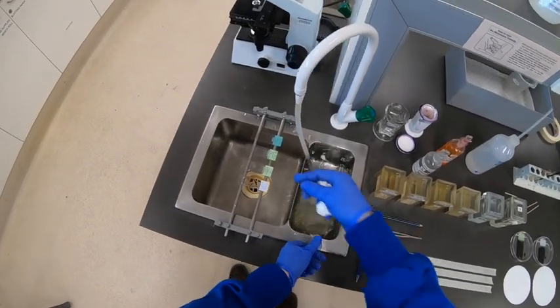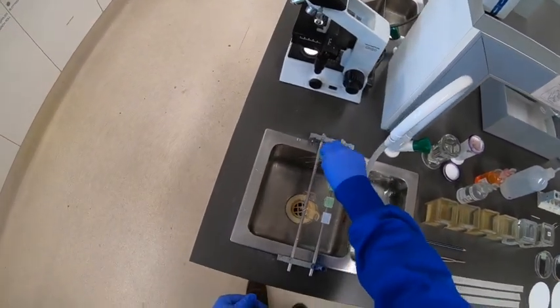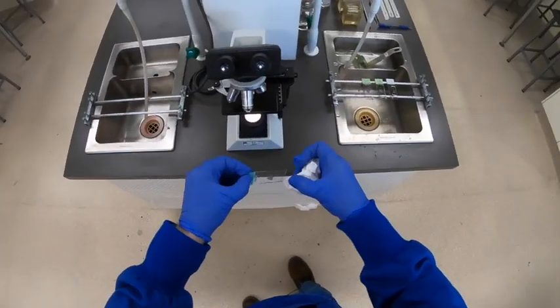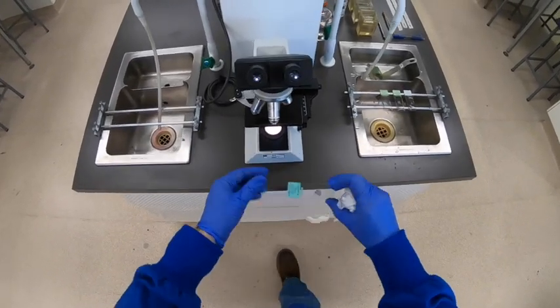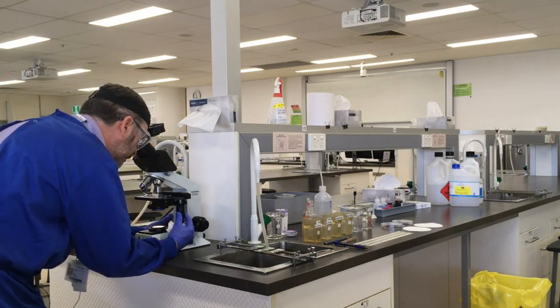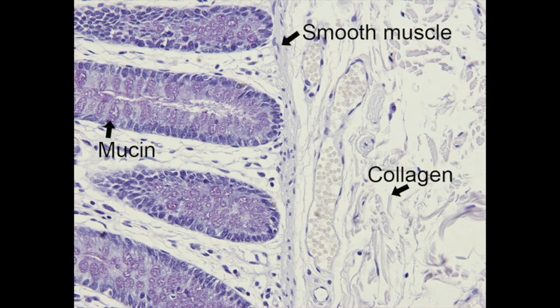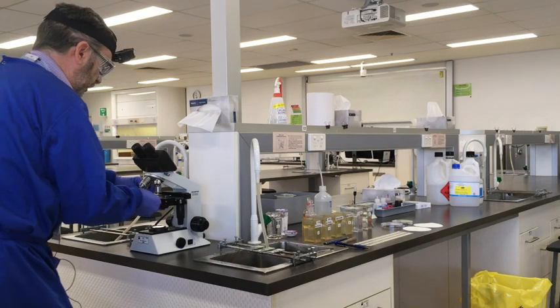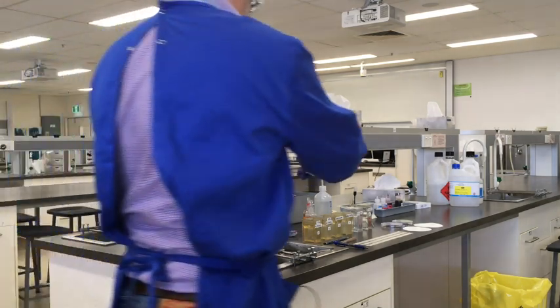You can see the smooth muscle essentially has no colour, and the collagen fibres equally have little colour, whereas the nuclei stand out quite well. So that's turned out pretty good — I'm happy with that. Put that in the water bath; it can sit there for as long as you like, there are no changes that will take place there. Now the next slide: wipe the back to get off the excess water — we don't want that getting onto the condenser. This one's a bit different. We can see this is some colon and there's quite a bit of heavy hematoxylin still in the goblet cells. The collagen is quite blue and the smooth muscle also has a bluish colour — a good sign of requiring further differentiation.